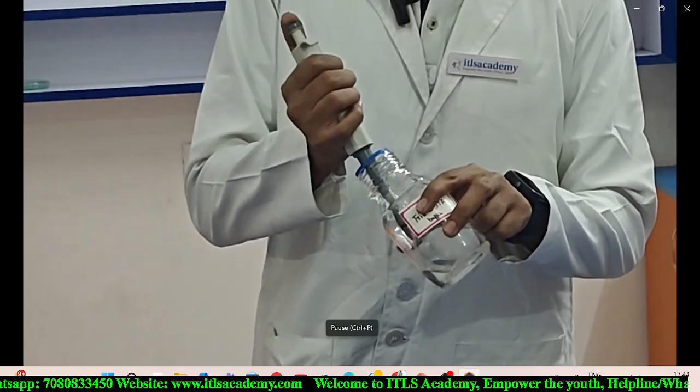So after adding 50 microliter of TE buffer in each of the Eppendorf tubes, now our process of DNA extraction is completed. Now we are going to store these in the refrigerator for performing the further processes like PCR, gel electrophoresis, etc. Hope you got it.